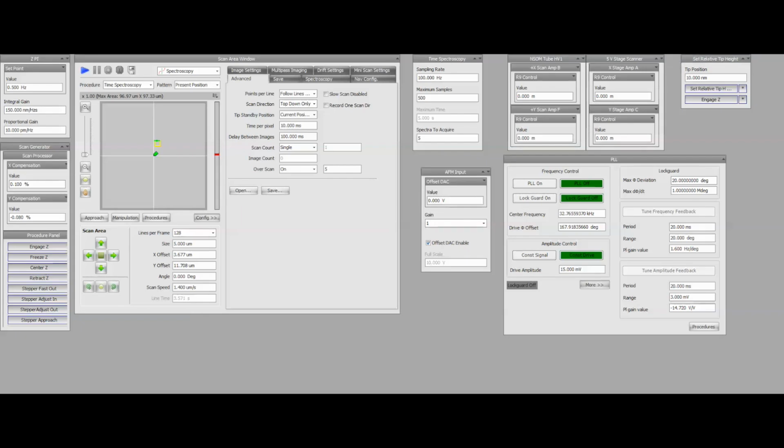How are you today? I'd like to go over an example that I think would be useful for people, based on what a customer had asked if we can do. So this customer wants to basically have a measurement that is synchronized between two procedure activities. He wants to tell the procedure to start recording. He wants to then be able to do as many independent things as he wants, and then he wants a procedure to say stop recording.